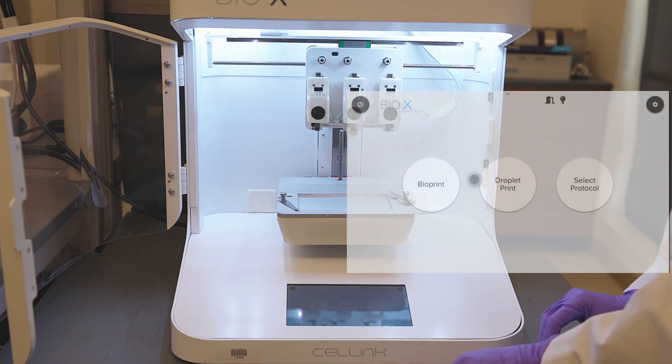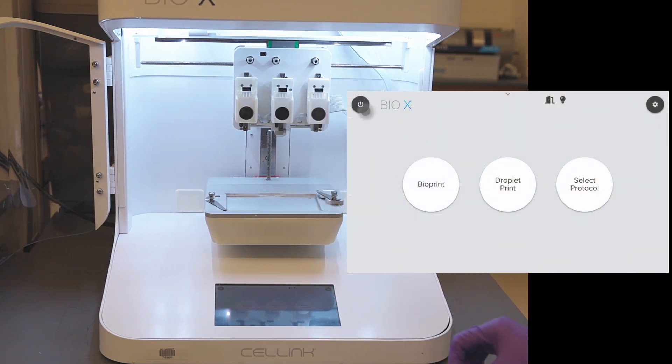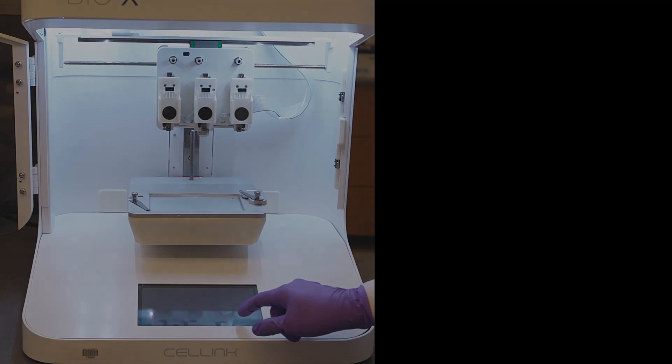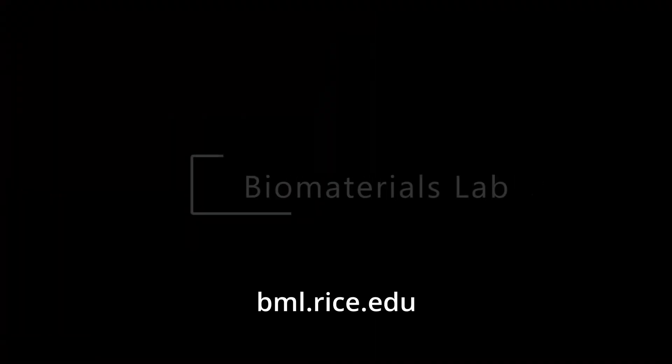We can power off by pressing the power button and tapping on power off. For further information or questions, please contact the Biomaterials Lab Manager. Thank you very much.